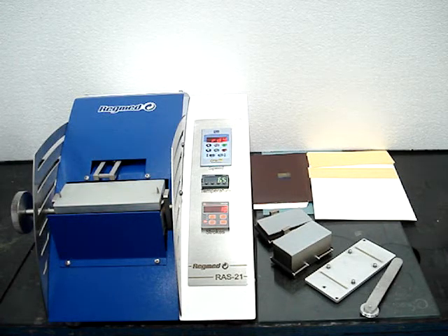Ink Rub Tester model RAS21 from Regmed. Setting up equipment for a test.